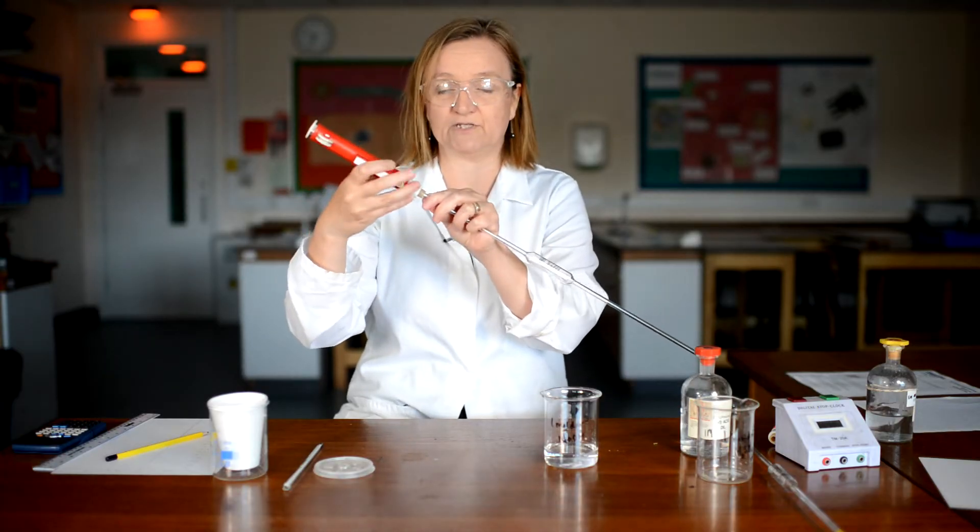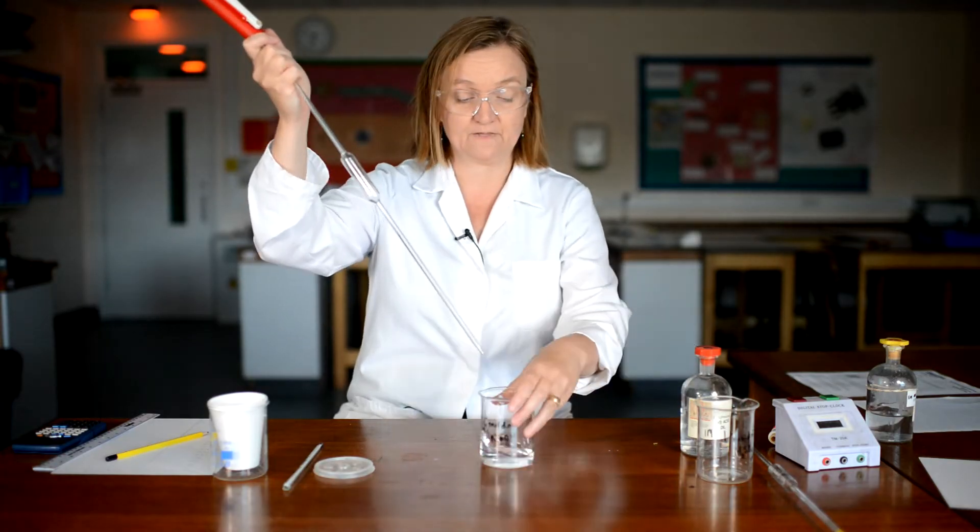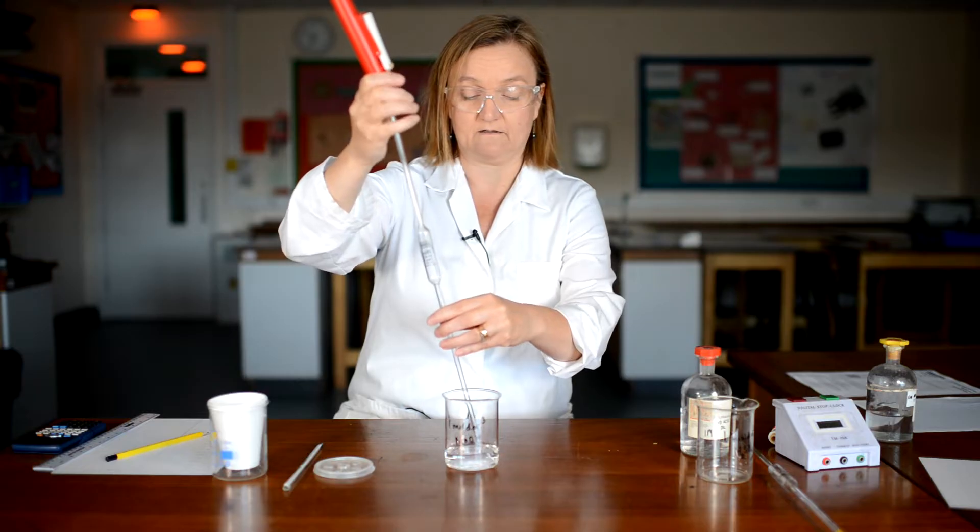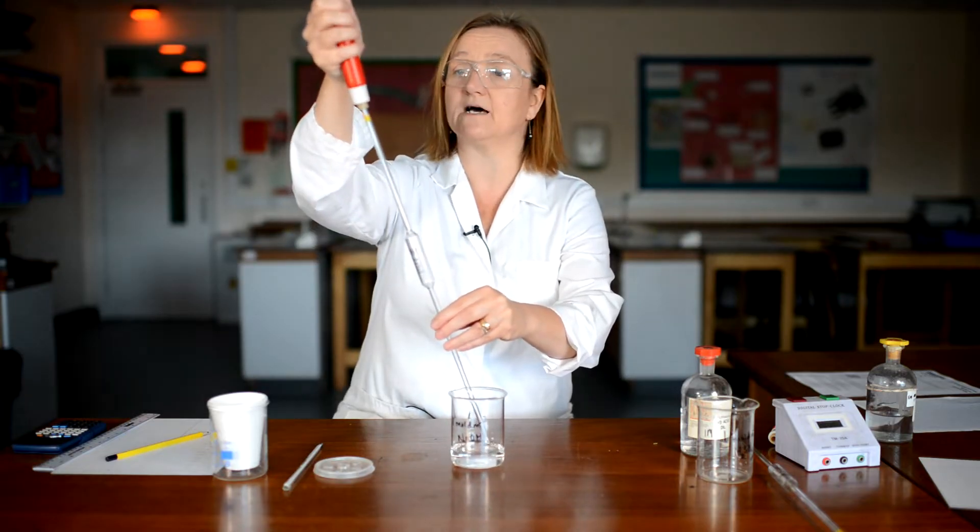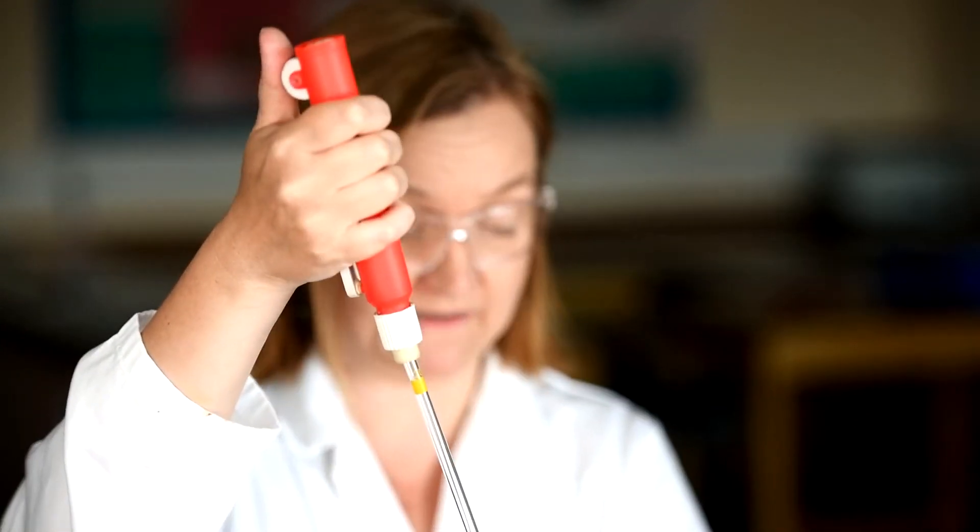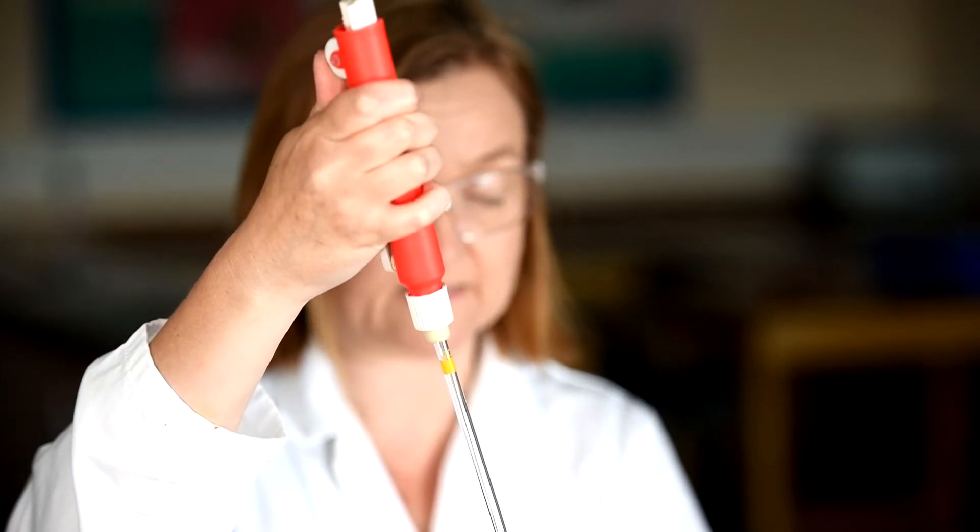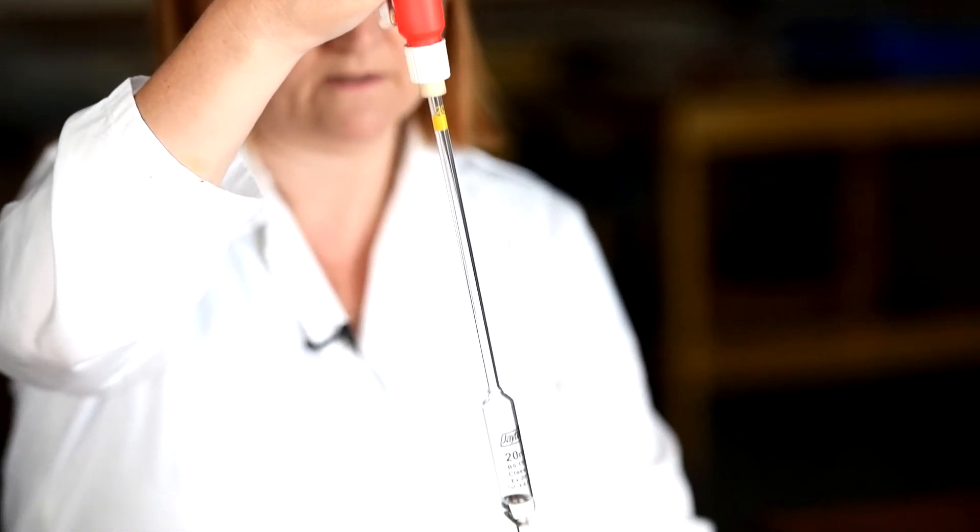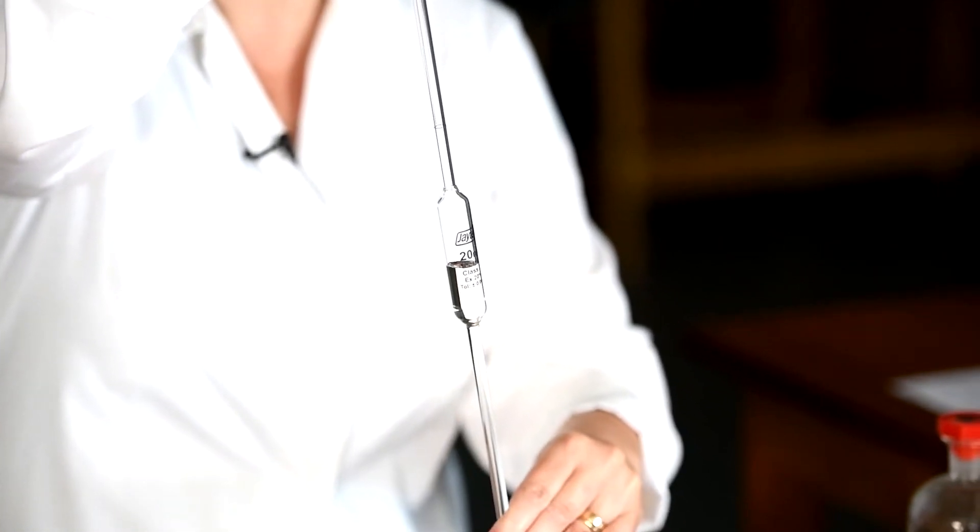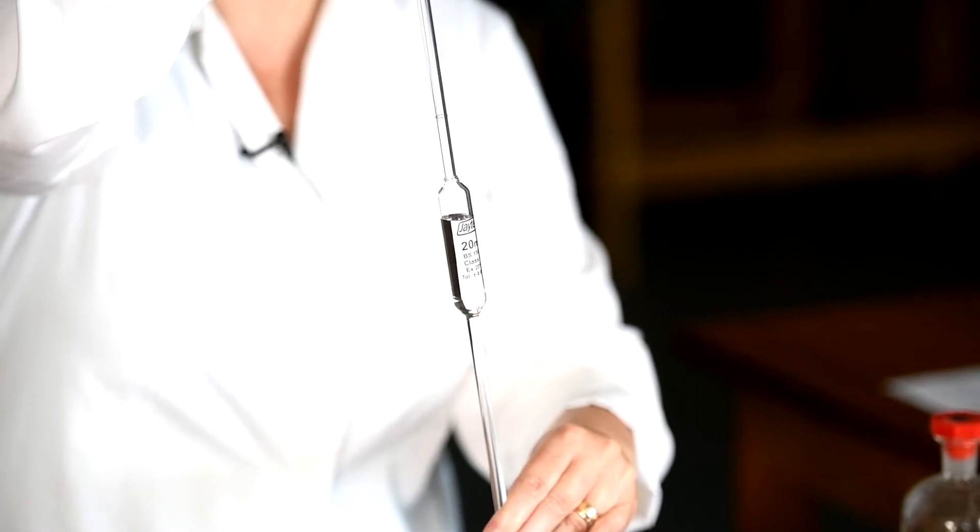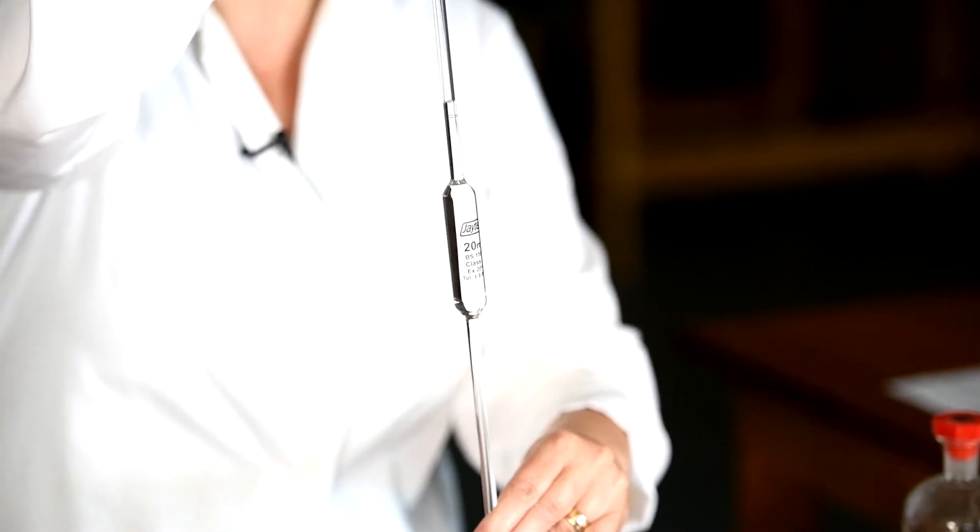So you hold it at the top, push the filler on safely and then placing it into the sodium hydroxide. So now turning the wheel, the solution is sucked up into the pipette, past the wide bit and nearly all the way up to the filler.